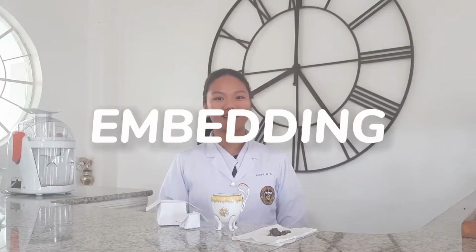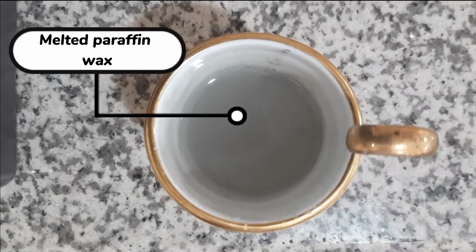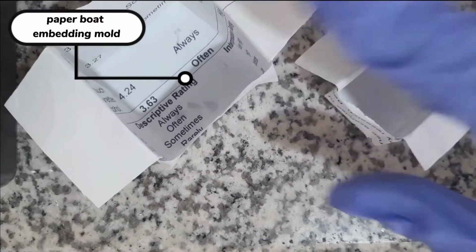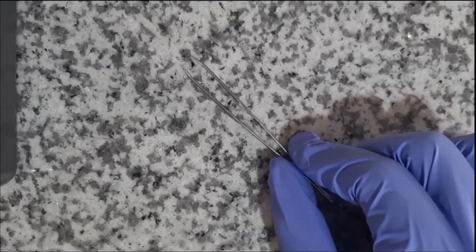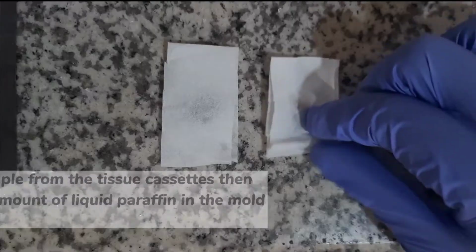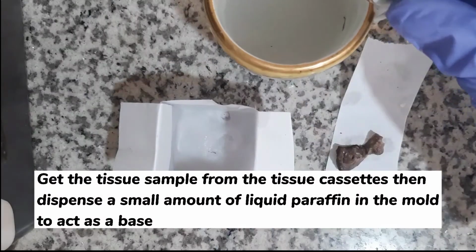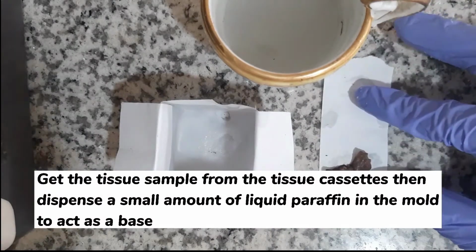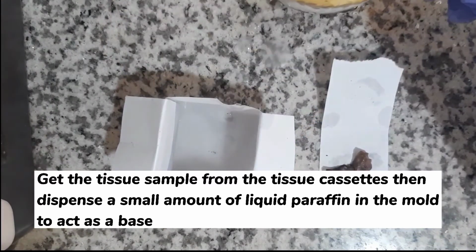Good day everyone. I am Kayla Dote from DSMLS 2I and I am here to perform the embedding process. To perform the process, we need our melted paraffin wax, paper boat embedding mold, tissue specimen, and forceps. Let us get our tissue sample from our tissue cassette. Then, dispense a small amount of liquid paraffin in the mold to act as a base.